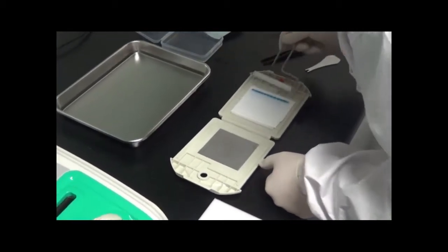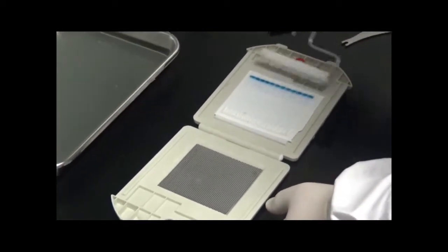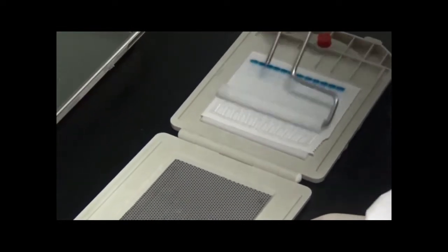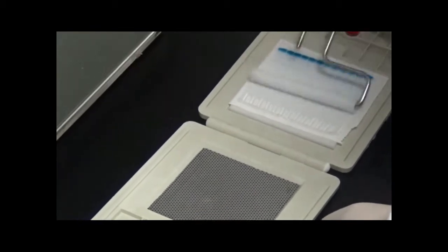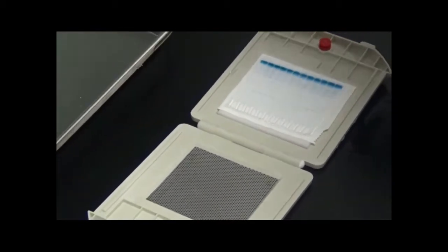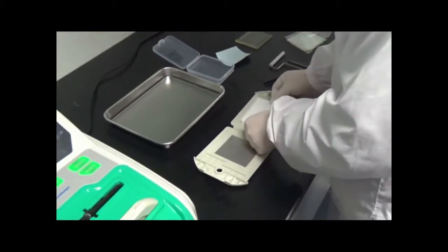Remove any air bubbles that may be trapped between the gel and the membrane by using the roller. Lastly, place the other dry sponge on top of the gel to complete your transfer sandwich.